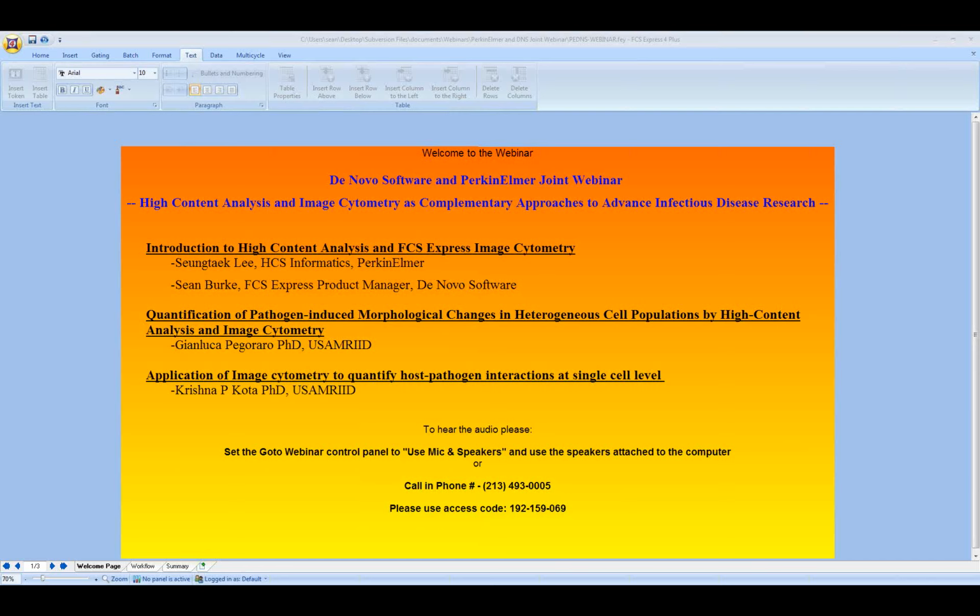Such things like taking multi-channel fluorescent data, plotting that data in scatter plots and histograms to look for statistically significant differences and changes. But what we can now do is take that image cytometry data that you're getting from any of the Columbus centralized places or instruments. You can take that data and leverage the most powerful analytical tools that we have in our flow cytometry package to analyze those multi-parametric imaging data sets.